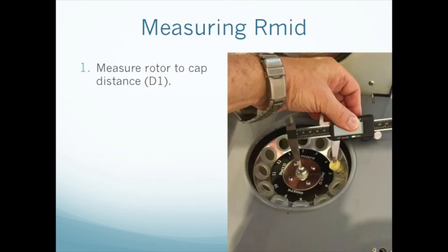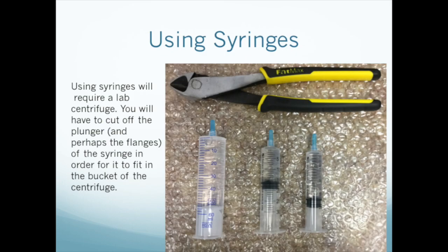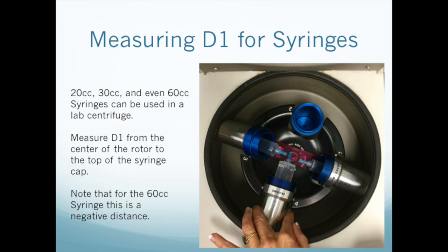To determine R-mid on your centrifuge, first measure the distance from the center of the rotor to the top center of the sample container — we're calling this distance D1. If you're using syringes, you'll need to cut off the plungers and perhaps the flanges in order for them to fit into the centrifuge buckets. We use a pair of diagonal cutters like the ones pictured here. In our lab centrifuge, we've been able to successfully use 20, 30, and 60 cc syringes. Note that every brand of syringe is different, and even if they're the same capacity, the dimensions will differ. Here we see three different sizes of syringe placed in the buckets of a lab centrifuge. Measure the distance D1 from the center of the rotor to the tip of the cap of each syringe. Note that the tip of the 60 cc syringe in bucket 4 extends beyond the center of the rotor, and thus the distance will be negative.